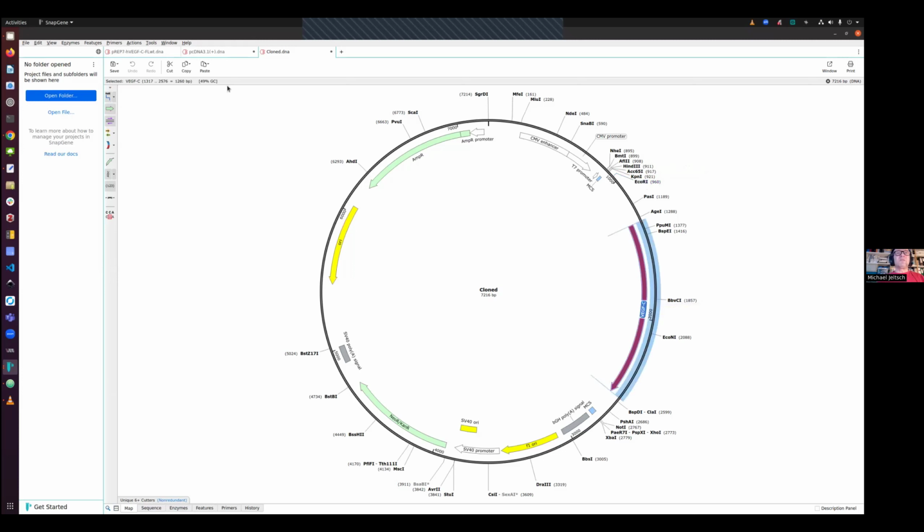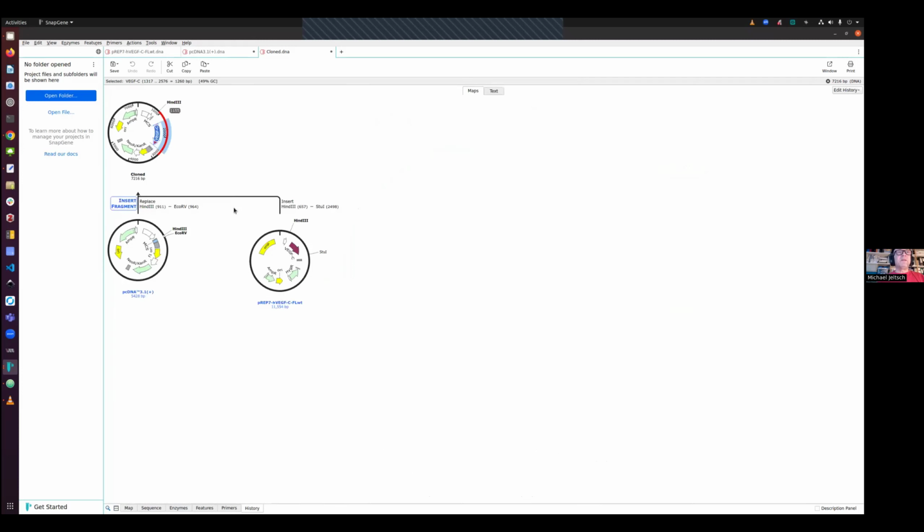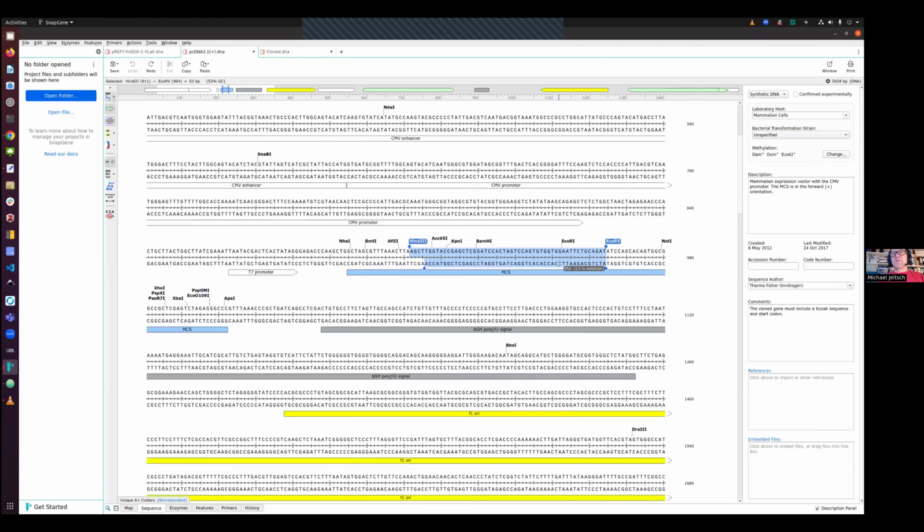One more thing: you always want to have two starting plasmid vectors. If you make synthetic DNA, you can of course start from a linear vector, but this is typically the exception, especially when we are dealing with so-called subcloning, which means we are starting from two plasmids. So you don't want to have anything that is a linear fragment here, because you don't really have linear fragments in your freezer.